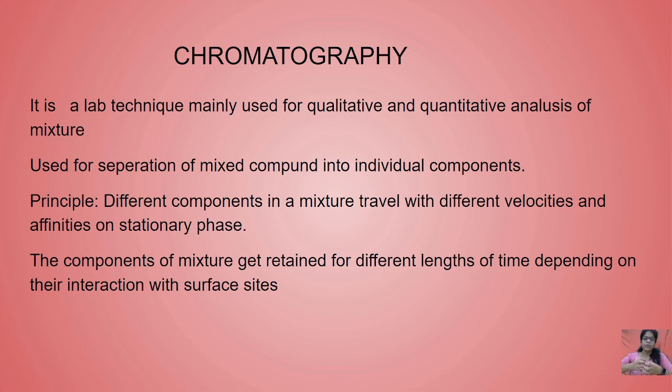The affinity and velocity of a molecule between the stationary phase and mobile phase decides your retention time. This is what is called chromatography.